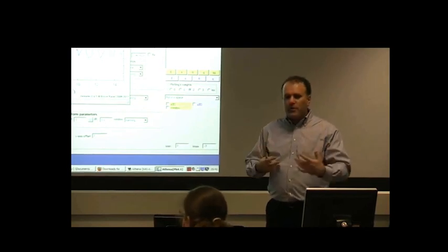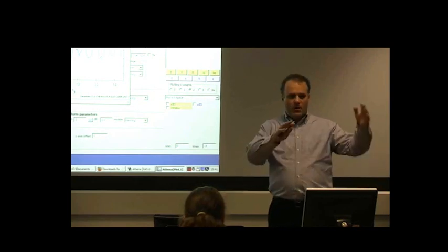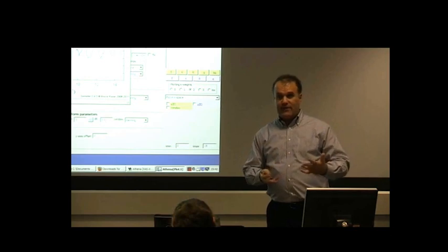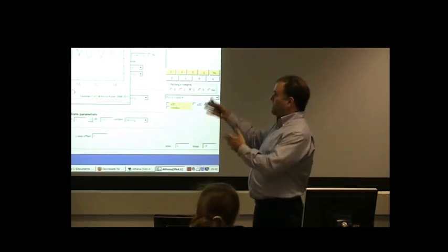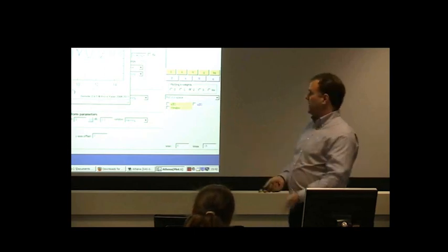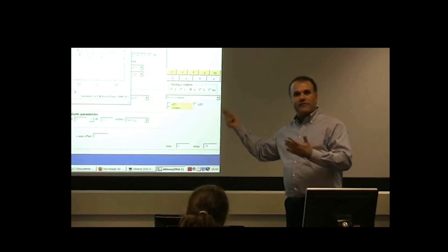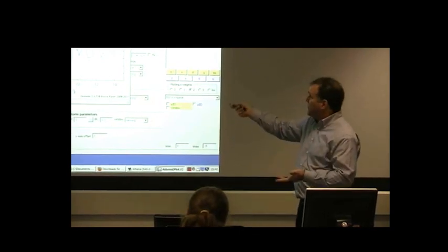There's a really good reason to do that in terms of the data analysis, but I'm a long way away from being able to motivate the really good data analysis reason for doing it. The data visualization reason is that by k-weighting, we can actually see and examine and evaluate the statistical quality of these oscillations up here.